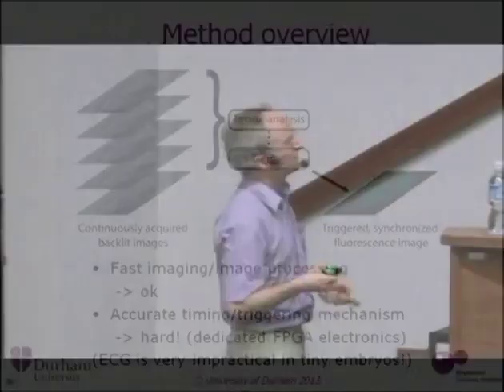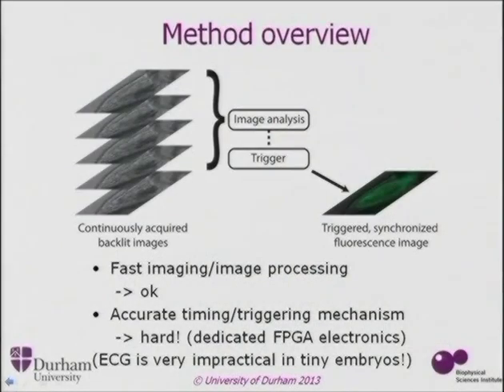The other way they do it is they take a very long stream of video, and they go, well, it's nearly the same position there and there and there. It's not accurate enough. So what we've done is we've synchronized the imaging to the beating heart. I said we take an infrared image, and I'm using this as an example of how you can pull together a series of methods, put them all together to solve a really challenging biological or potentially clinical imaging problem.